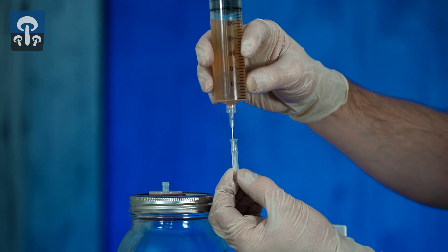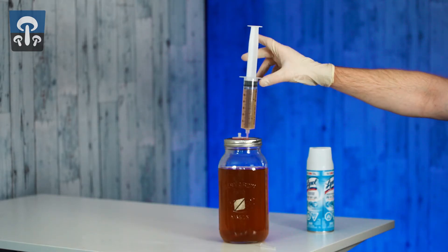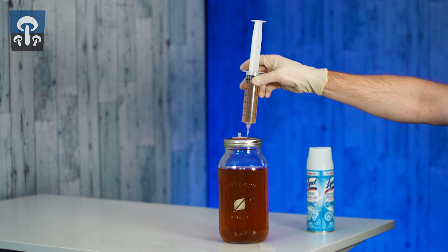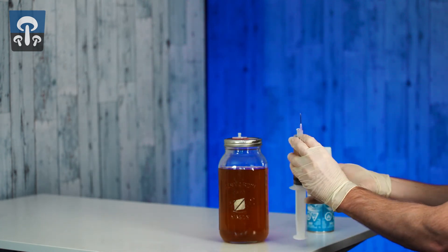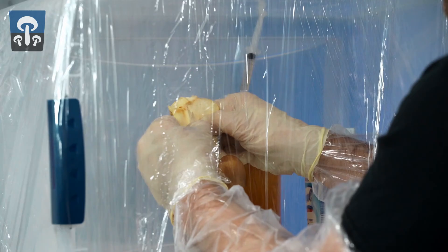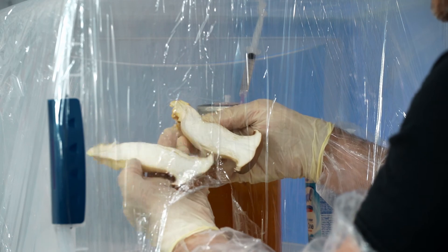Please note, you can use these syringes as masters to knock up other jars, but those other jars should not be used as masters themselves. You will lose growth vigor after multiple generations of liquid growing on liquid. To avoid this, go back to re-cloning a new fresh mushroom.